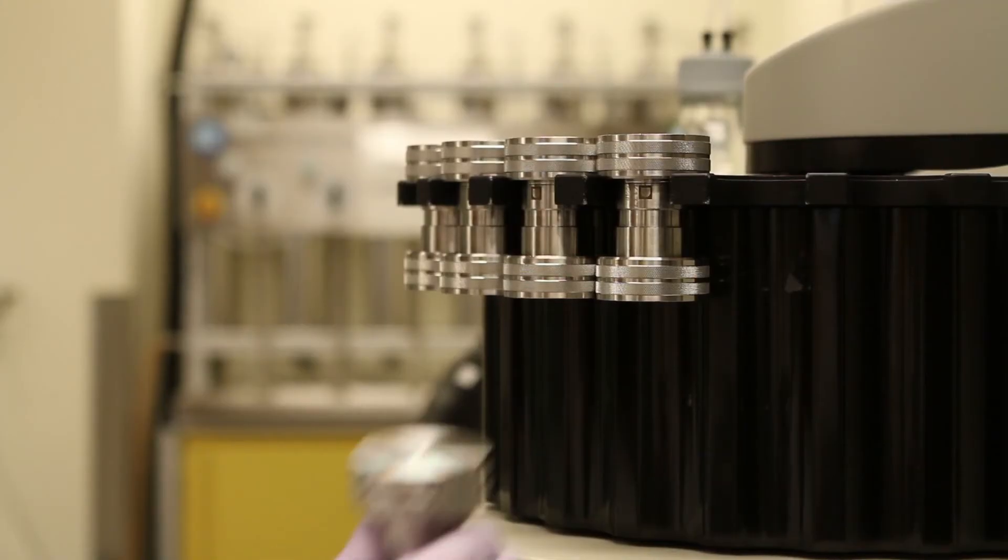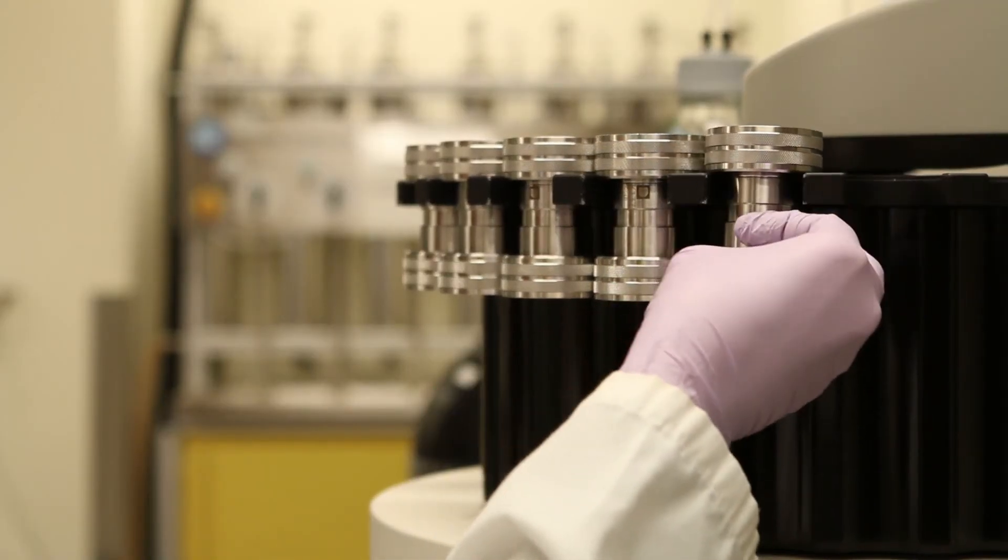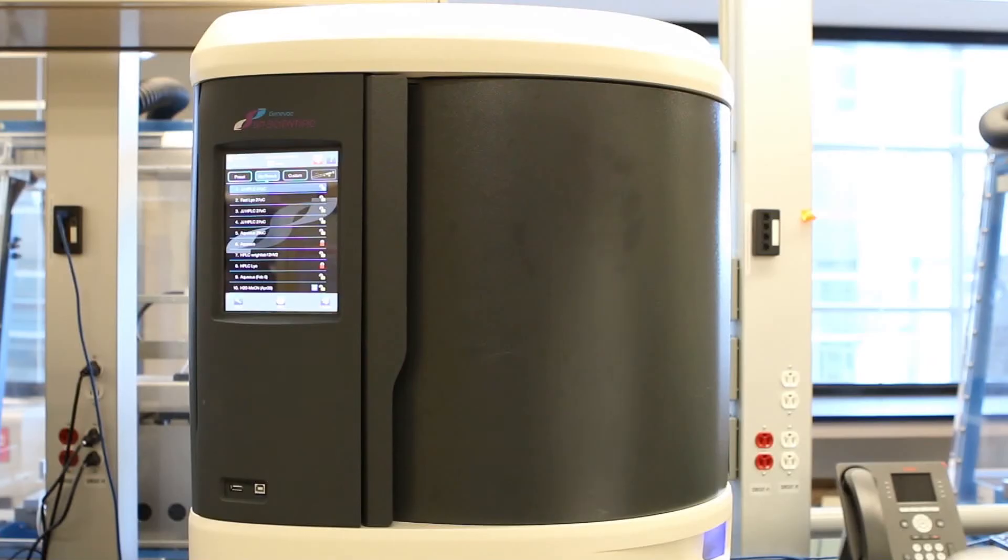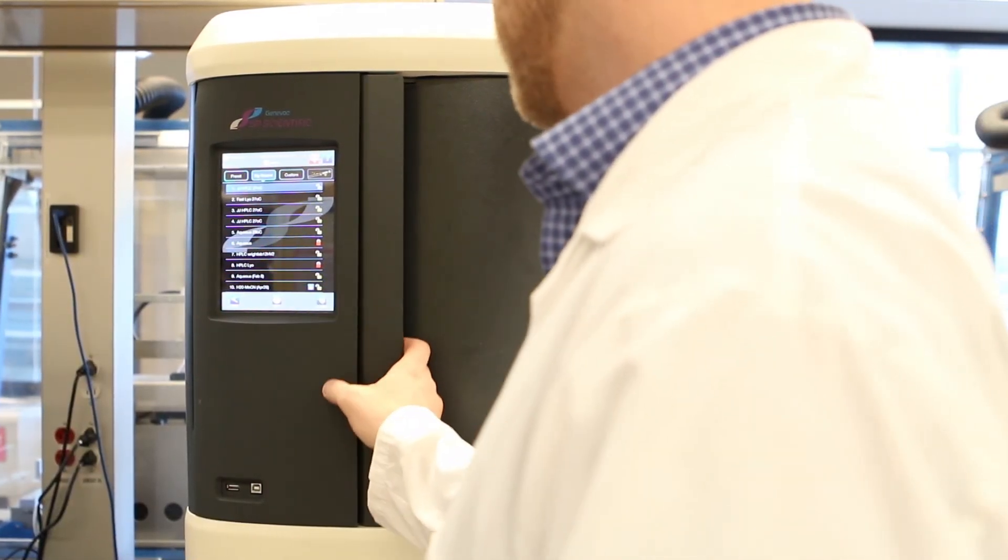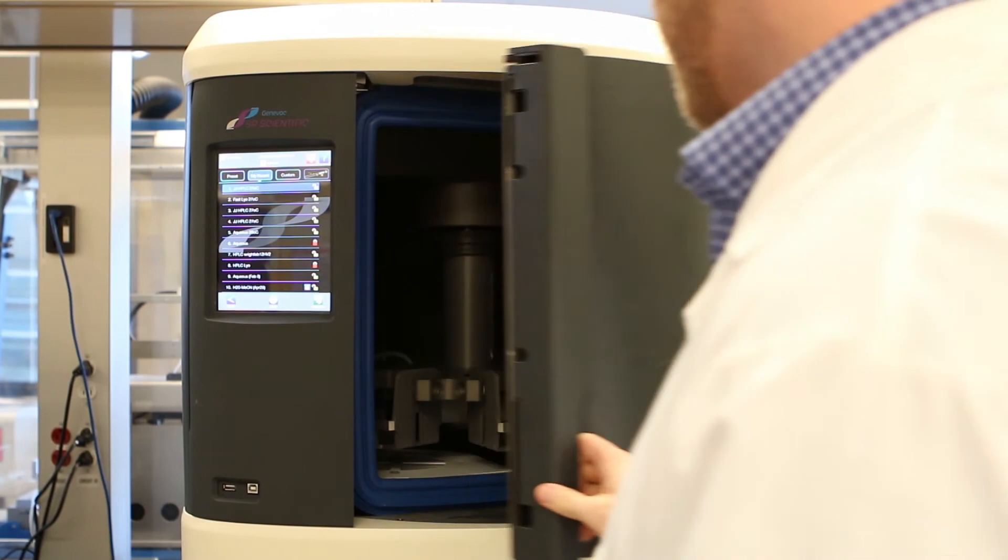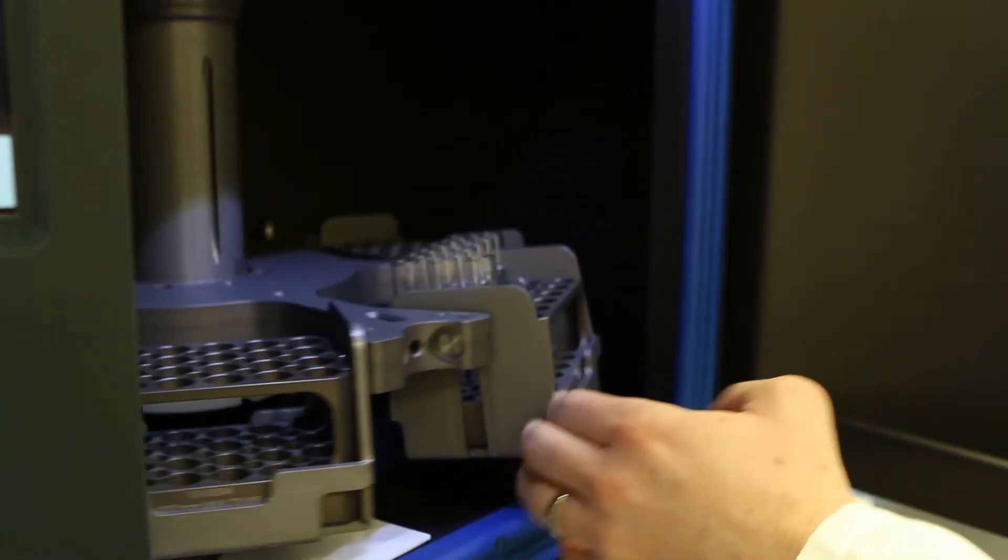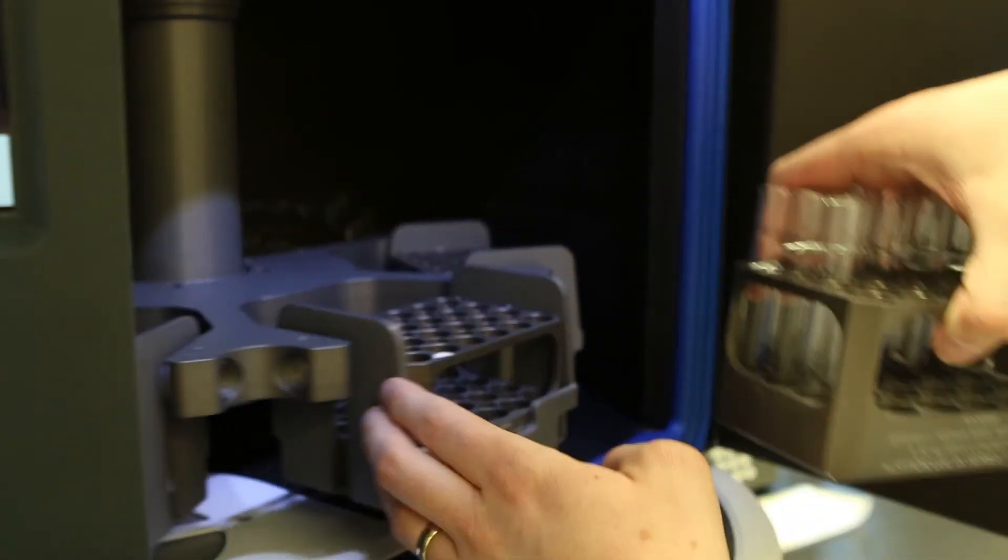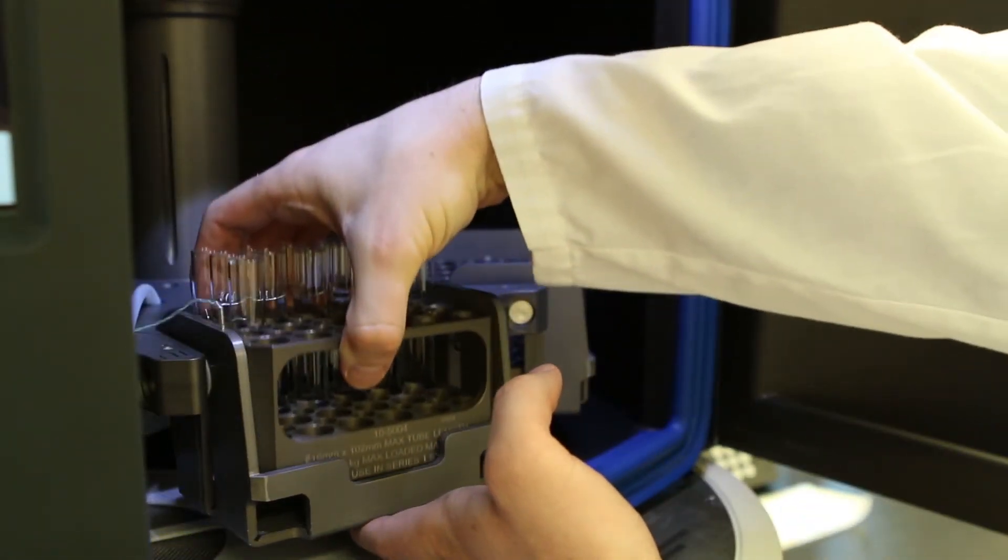Our highly trained technical staff can suggest the right way to do that experiment, can identify the right controls to use, and really walk that person through the entire process. Once that person becomes comfortable with it, the staff can then turn over the experiment to the student or to the postdoc or whoever might be doing the work. That way you get proficiency trained on very technical pieces of equipment with people who are absolute experts in it.